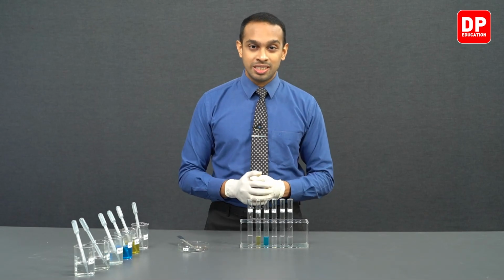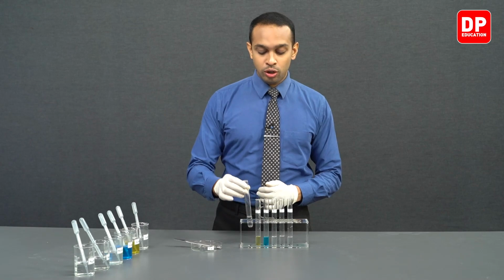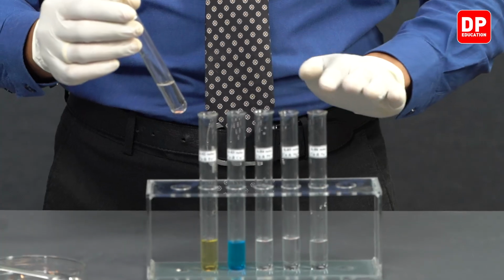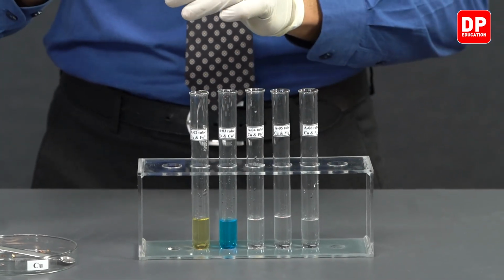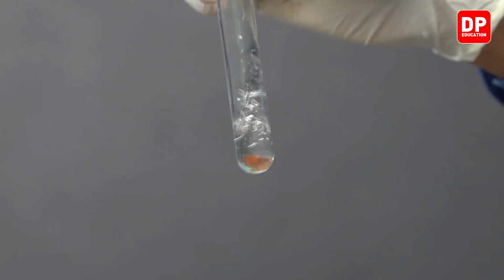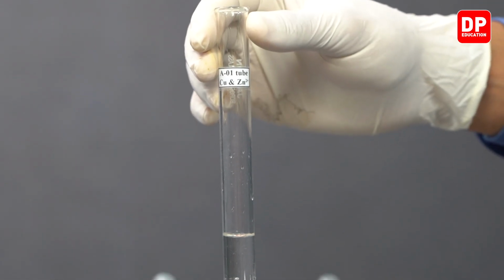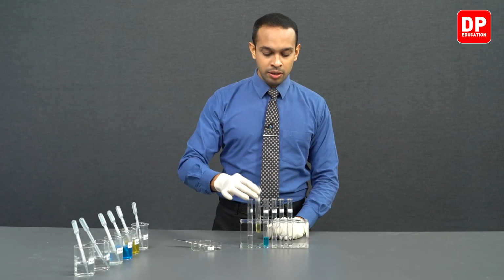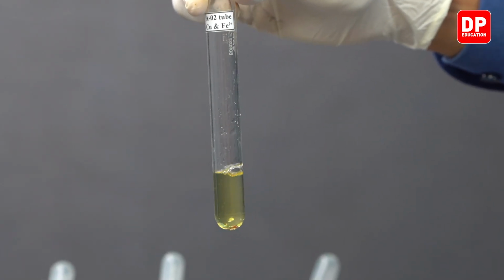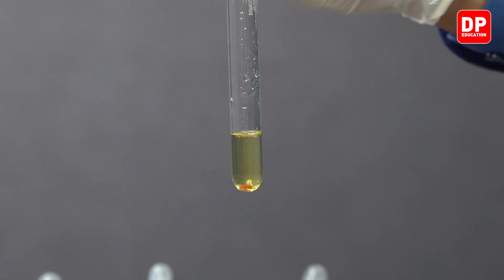of these solutions. Students, it has been 10 minutes and we can observe no color change or no formation of any precipitate in any of these test tubes. But let's closely observe. You can see when it comes to the zinc 2+ ions and copper metal, there is no reaction between the two. And when it comes to Fe2+ ions or ferrous ions and copper metal, you can see that there is no precipitate or any other color change observed here.